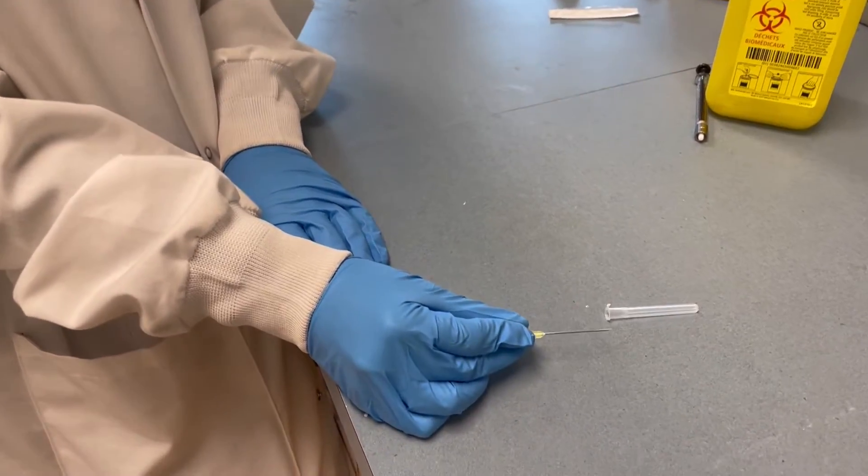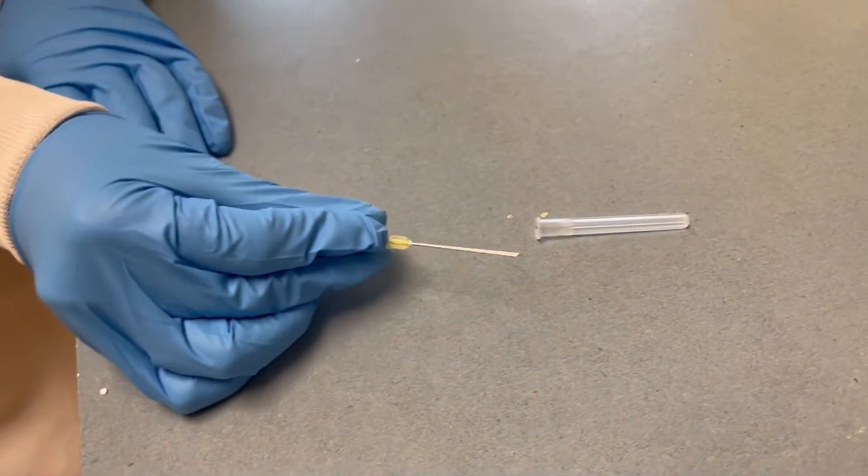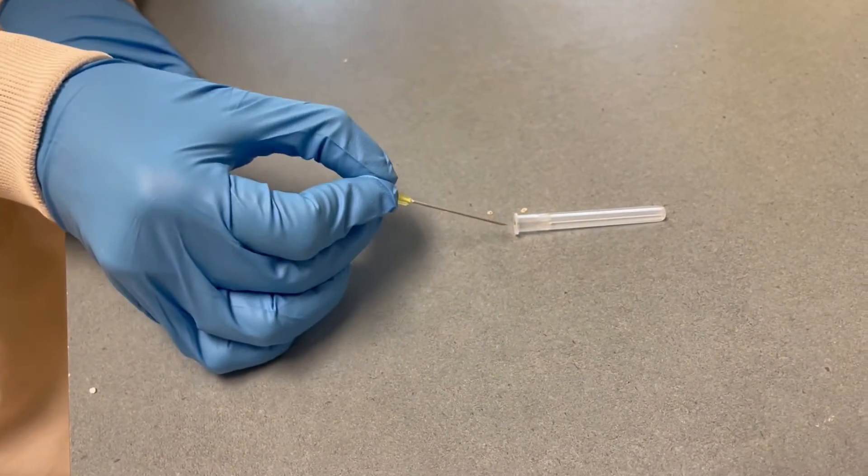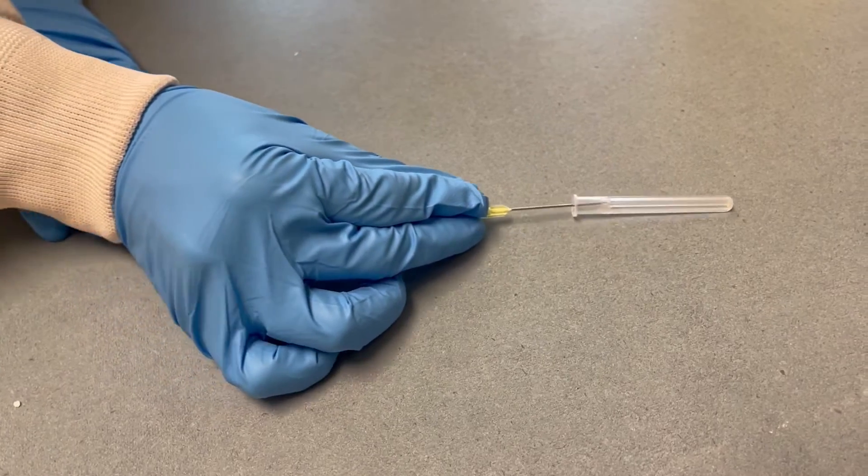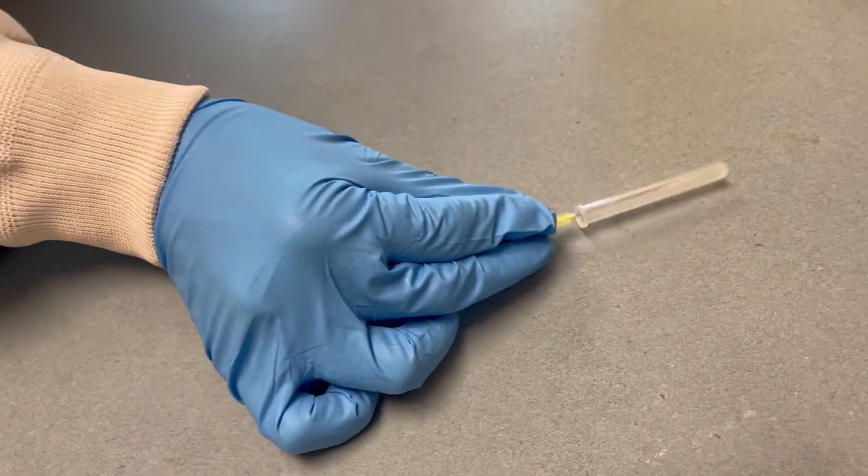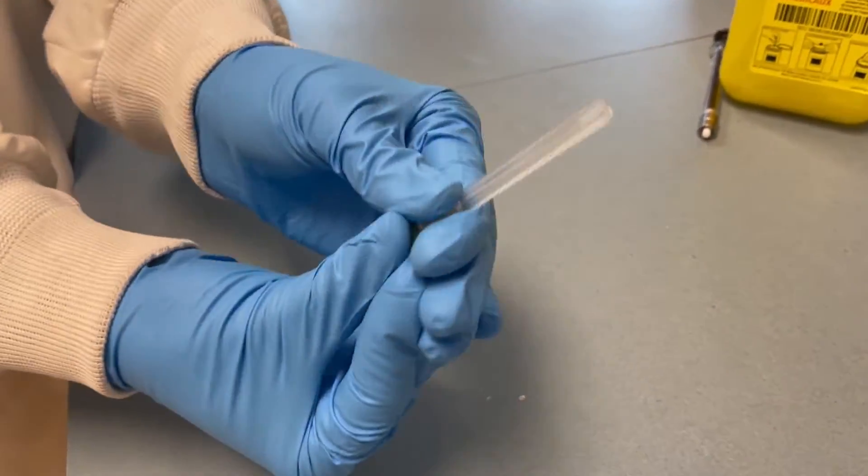Needles shouldn't be recapped, but if you must do so you want to use the scoop method, which is where you come at the cap at an angle, insert most of the needle in there until you can flip it back up and tighten the cap on there.